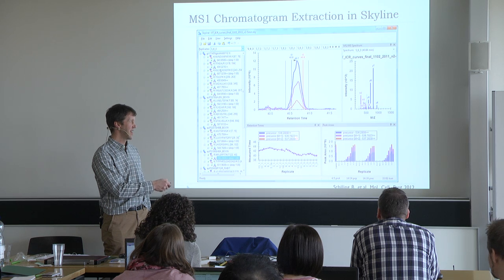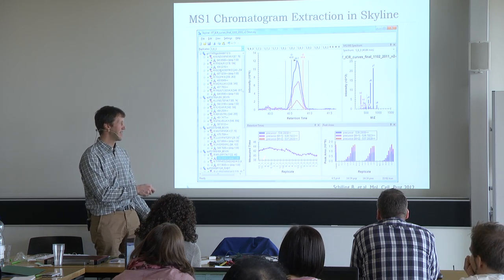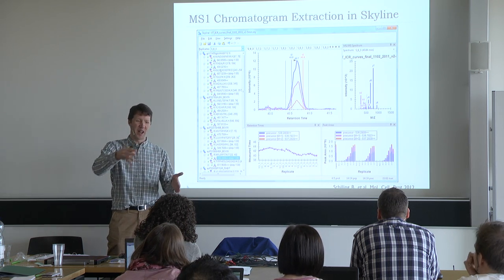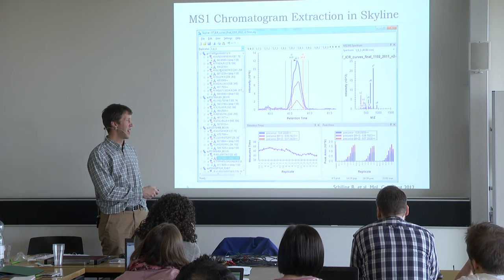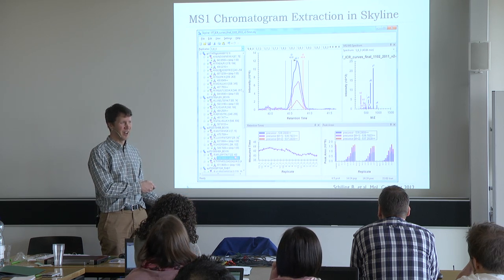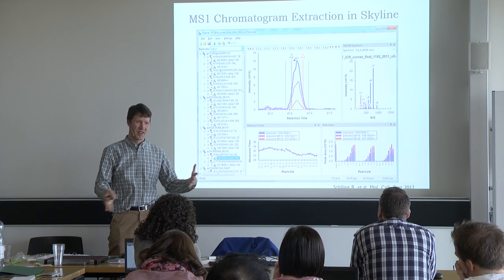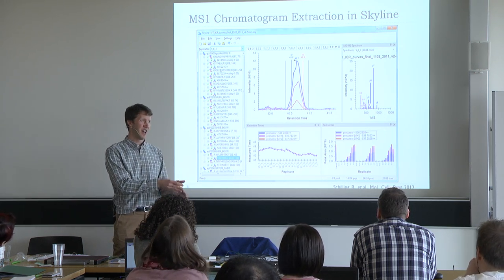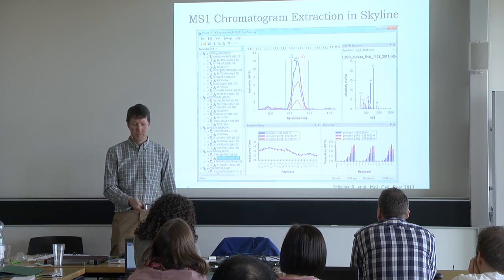So actually, this was part of the reason I developed the acquired time order. I got this data set and I had it logically ordered, and the retention times were jumping around all over, and I was like, wow, I'm really not used to seeing this much variance in the retention time. And then when I implemented acquired time order and flipped it into that, I got this nice smooth change in retention time. And so now you can see that it's a calibration curve collected in 3 cycles.